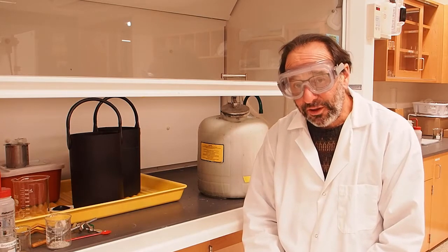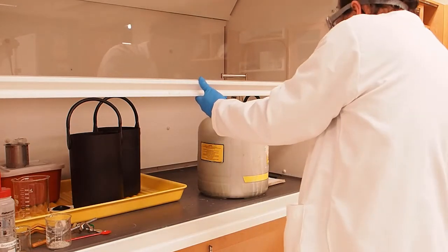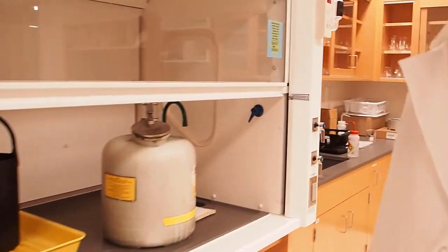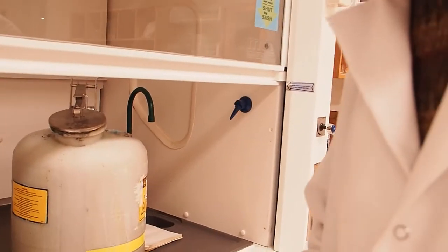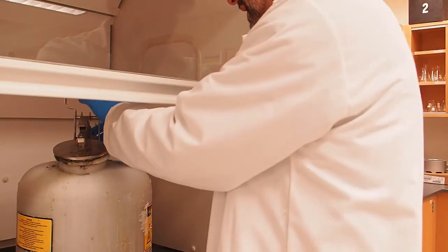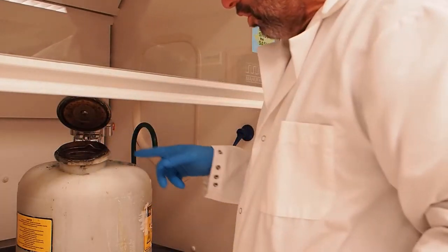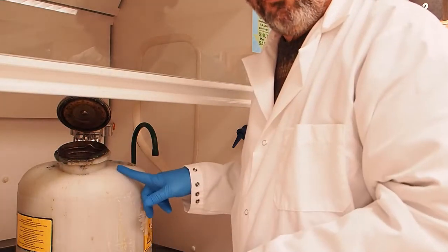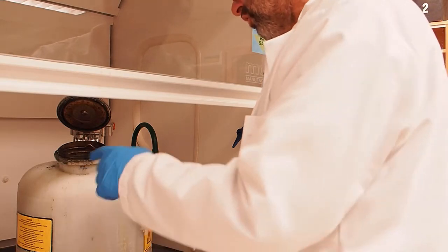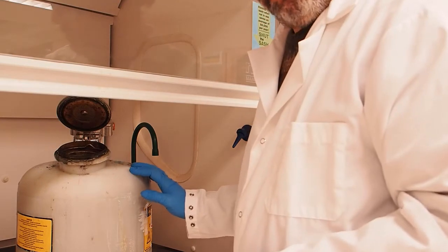A little trickier to handle is liquid waste. Liquid waste goes into a container, and I'll show you how that works. In the fume hood is a bottle like this that has a locking lid that you open up and lock to hold open while you pour things. This should never be left open overnight. It's okay to leave it open while you're doing your hazardous waste transfer into here, and then these are collected by the hazardous waste staff and handled properly.